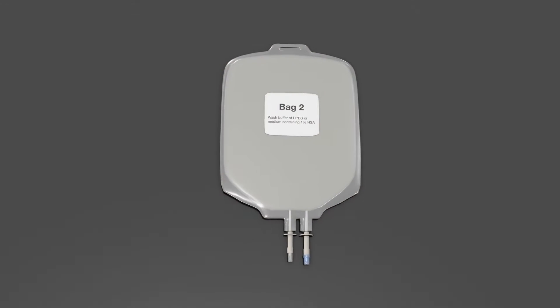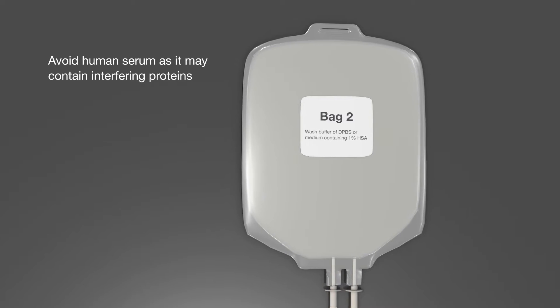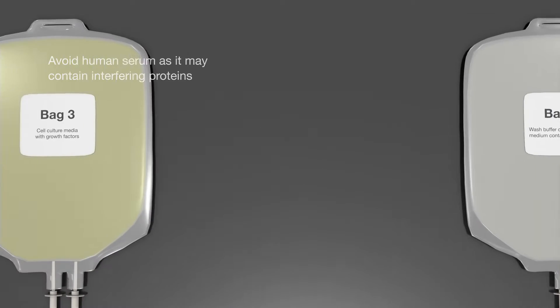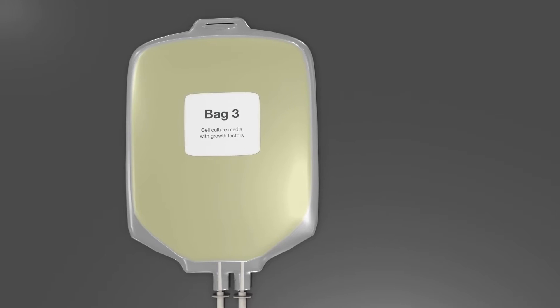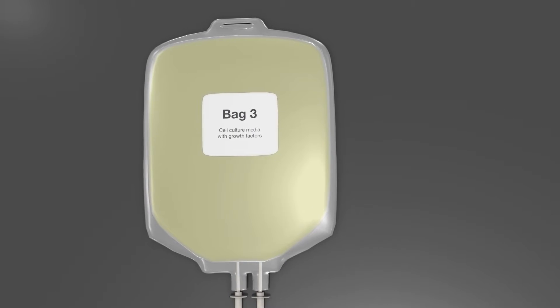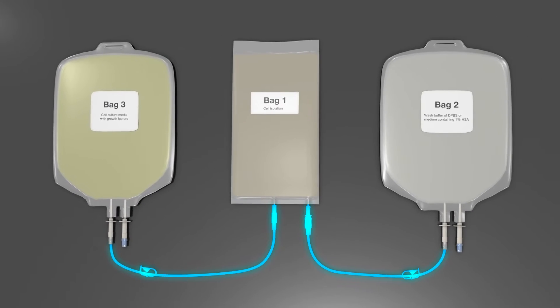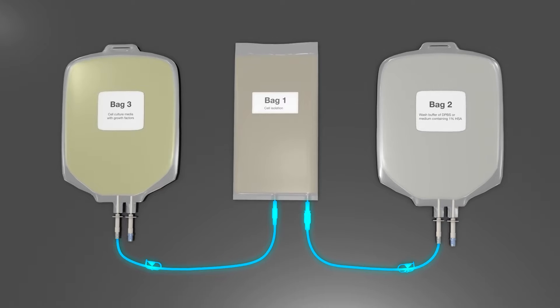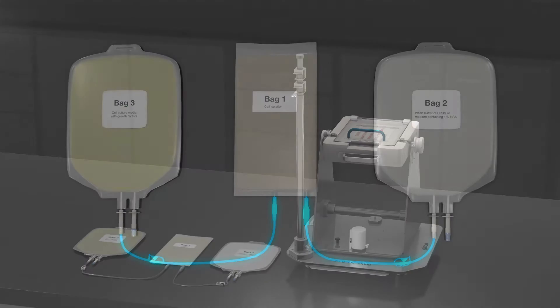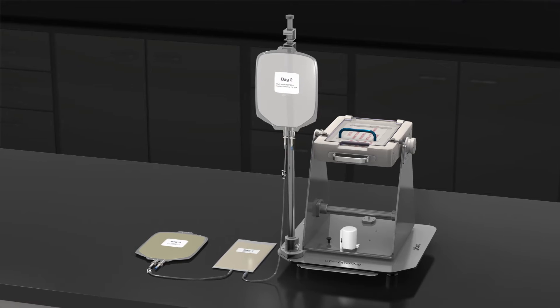Prepare a second bag, bag 2, filled with a wash buffer of DPBS or medium containing 1% HSA. Prepare a third bag, bag 3, with appropriate complete cell culture media including your chosen growth factors such as IL-2. Connect the three bags aseptically by tube welds or spike connectors, then install bag 2 on the solution pole of the Gibco CTS DynaMag magnet.